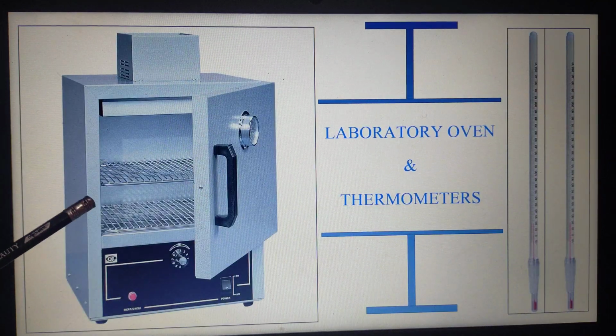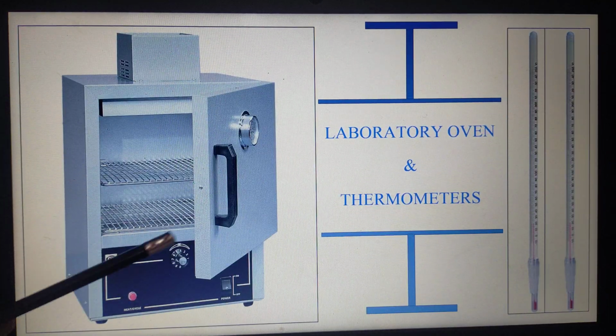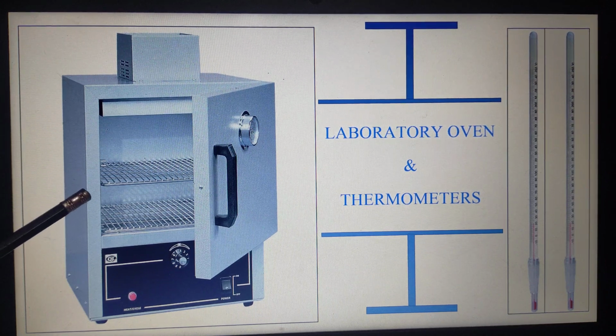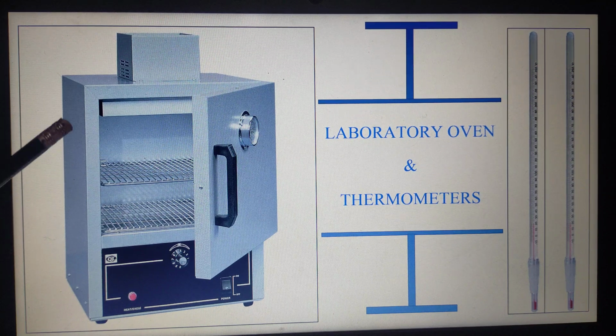And this is the lab oven. This is a large size lab oven which is also used for the sterilization process, and it is specifically used for dry sterilization. Once the glass vessels and utensils are washed, they are kept inside the oven to kill the microorganisms, and using this oven we can sterilize in a dry environment. So the oven is used for dry sterilizing the materials.